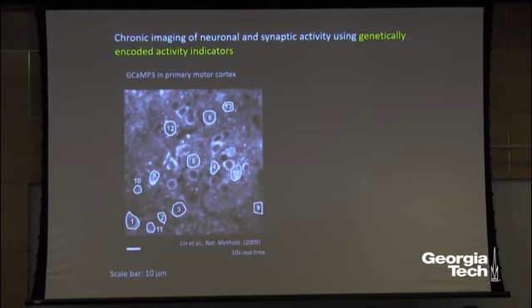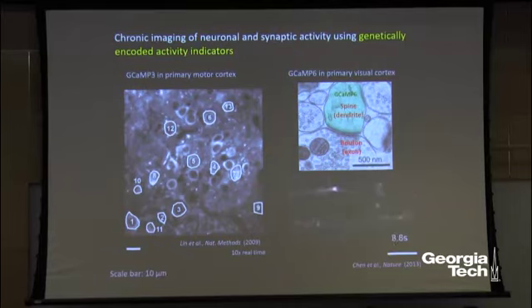So by imaging this brain, we can now convert this electrochemical signal into an optical signal that can be detected by the 2-photon fluorescence microscopy. Now, with newer versions of the indicator, for example, GCaMP6, which is a calcium indicator, you can even measure this process with the sensitivity of single synaptic terminal. Here are different types of dendritic spines that are activated by different types of sensory stimulus.